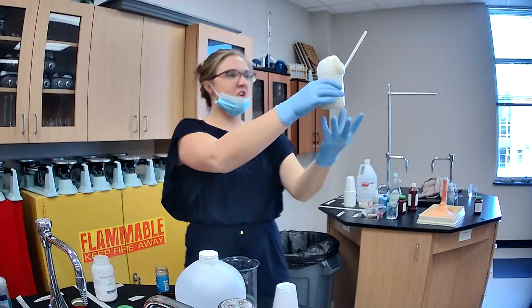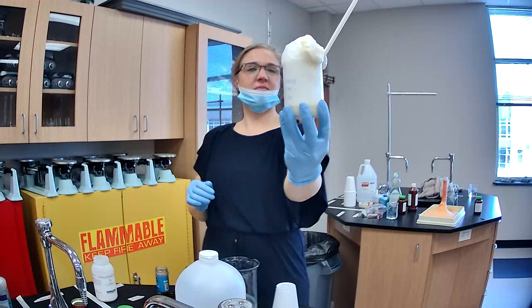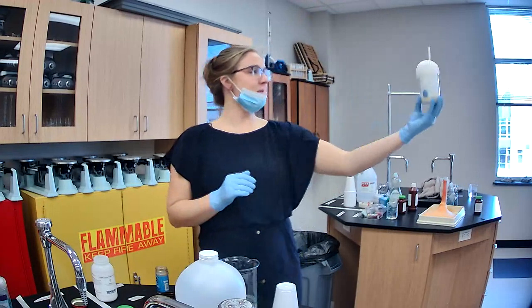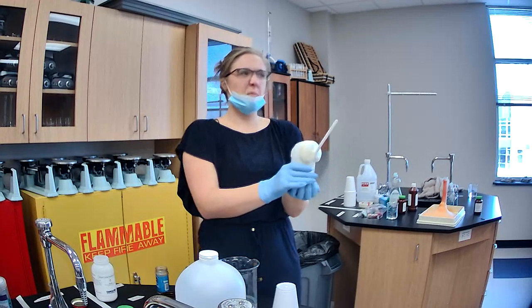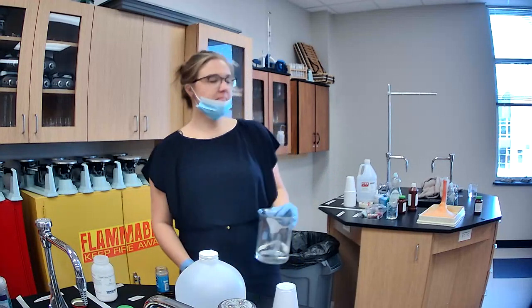You can see it creating much more. It's a little warm.